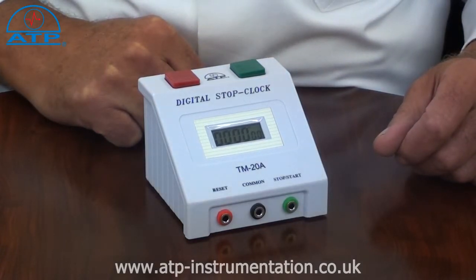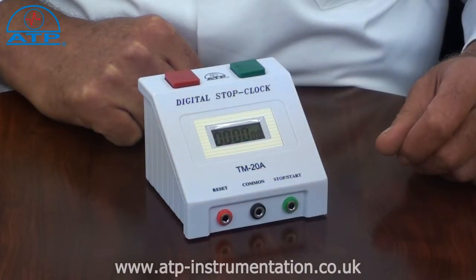It has a timing range from 0 up to 23 hours 59 minutes and 59 seconds. It has a resolution of one hundredth of a second for the first 30 minutes and one second thereafter.